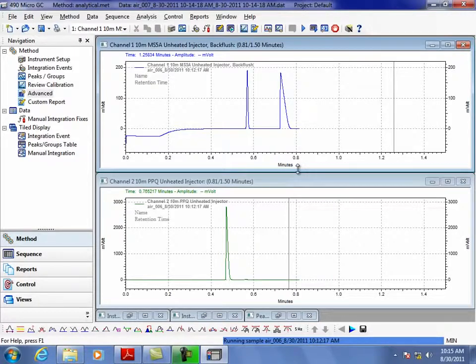Any questions? Anything that's not clear? When you're looking at the peaks, how are you sure of what exactly you're looking at? I mean, when you're saying this part is hydrogen or this part? That was because I saw a little bit of helium that was there from the earlier analysis. And helium and hydrogen have retention times that are almost the same. So it's just the times.